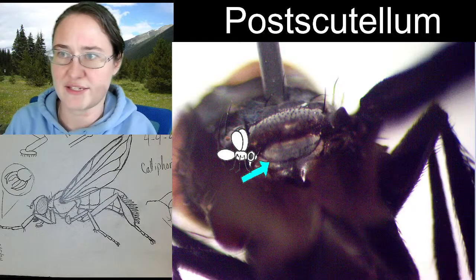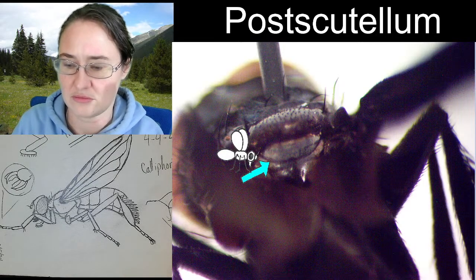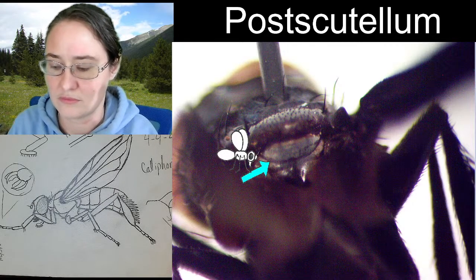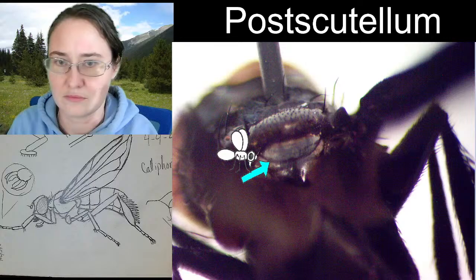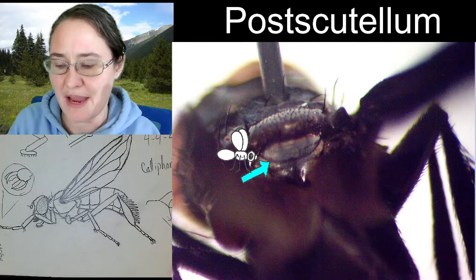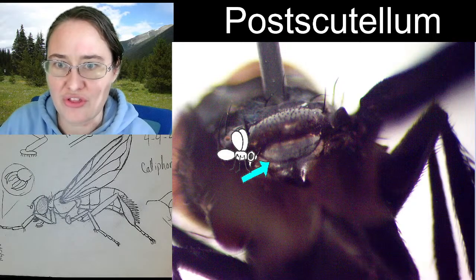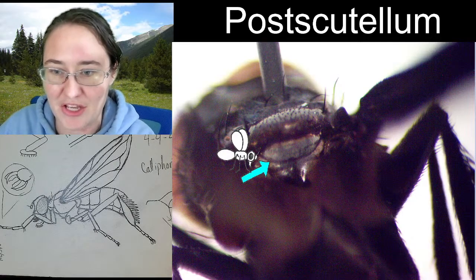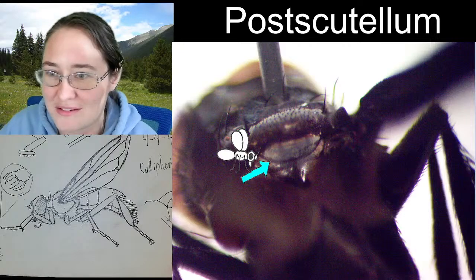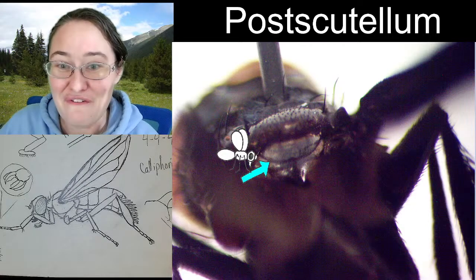I wonder if we can find this guy. So this fly was collected in New Jersey in 2022. And tachinids are parasitoids. So this guy fed on somebody so that it could grow up big and strong. Oh my goodness, what's the chances that it is called a... nope, not that one. But there are feather-legged tachinids. Cool!